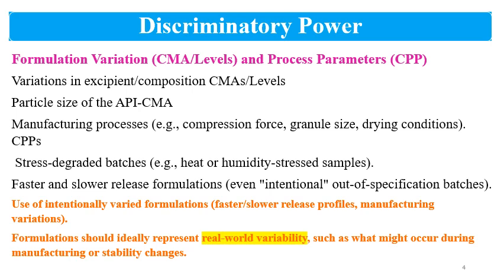If you are working on a formulation manufactured by wet granulation, and you show that the same formulation manufactured by direct compression is showing the discriminatory ability of the dissolution method, then it will not be a good parameter to show the discriminatory ability, because in the real world you are not going to manufacture that batch with the DC process.